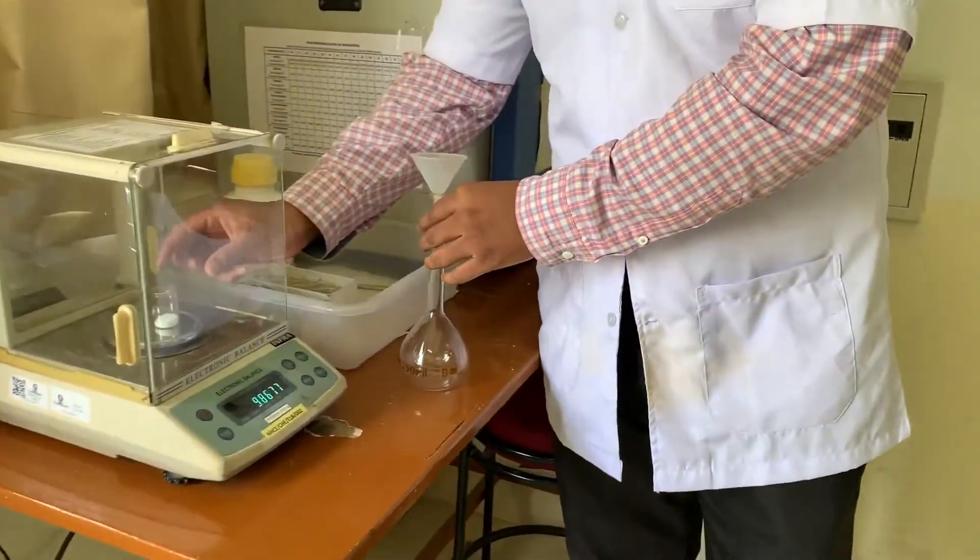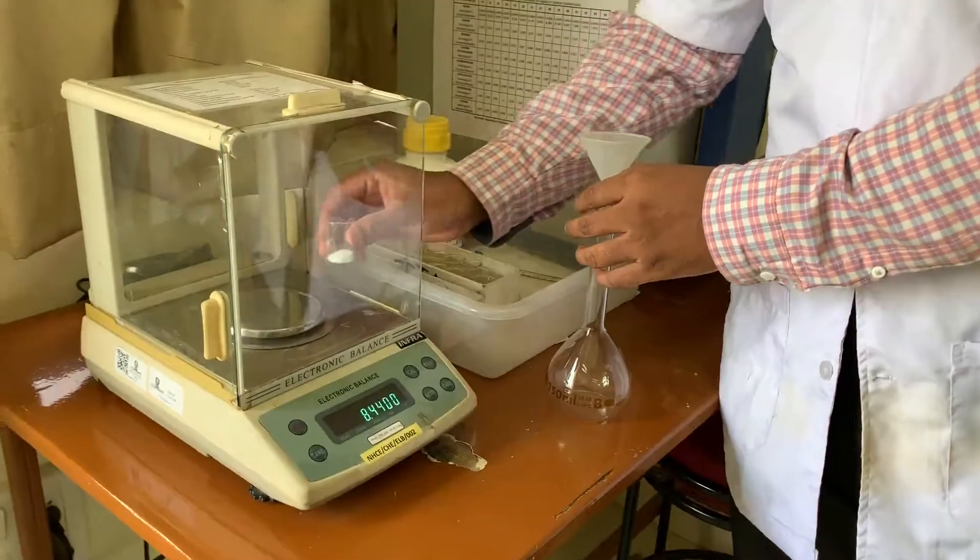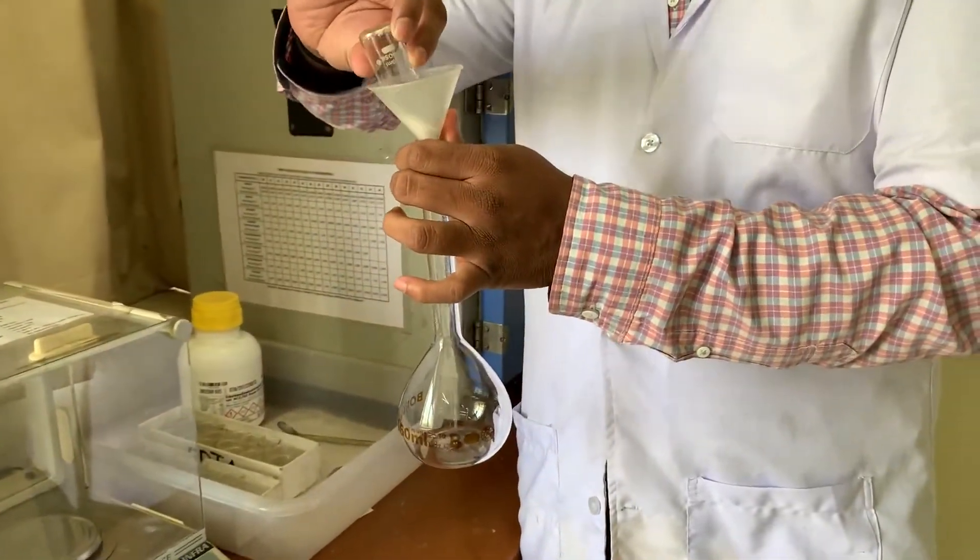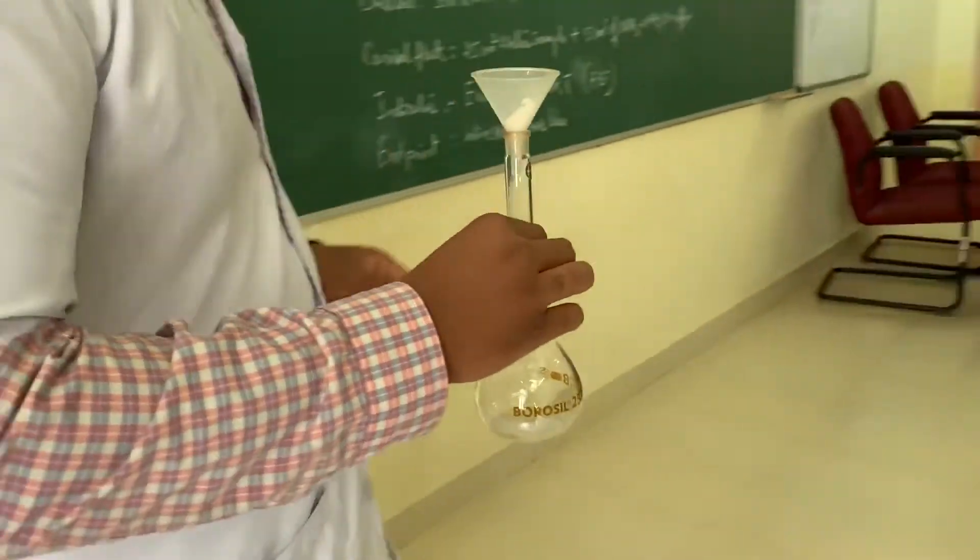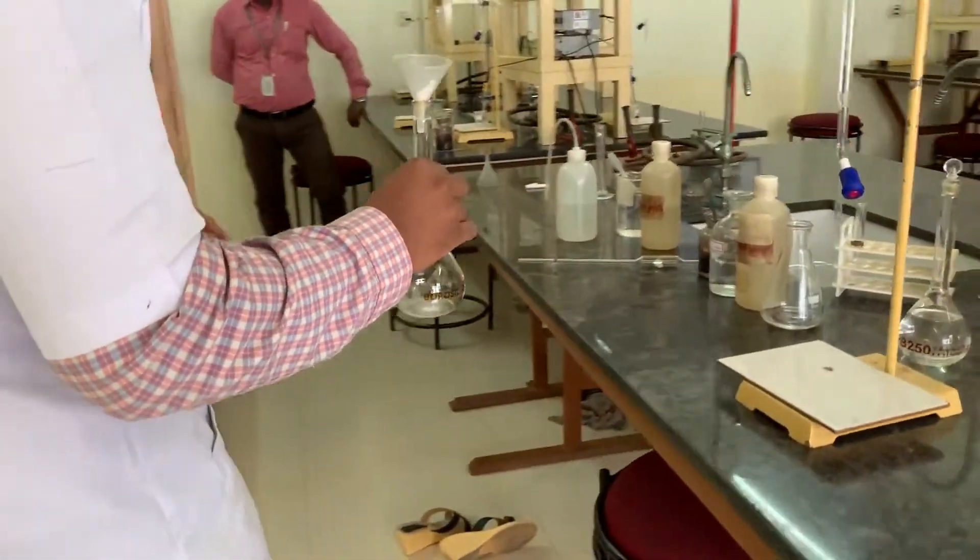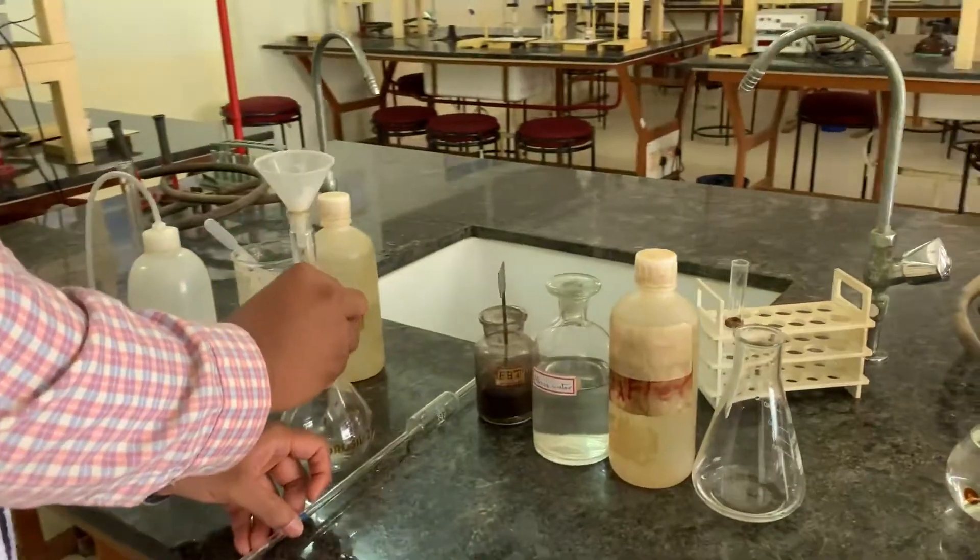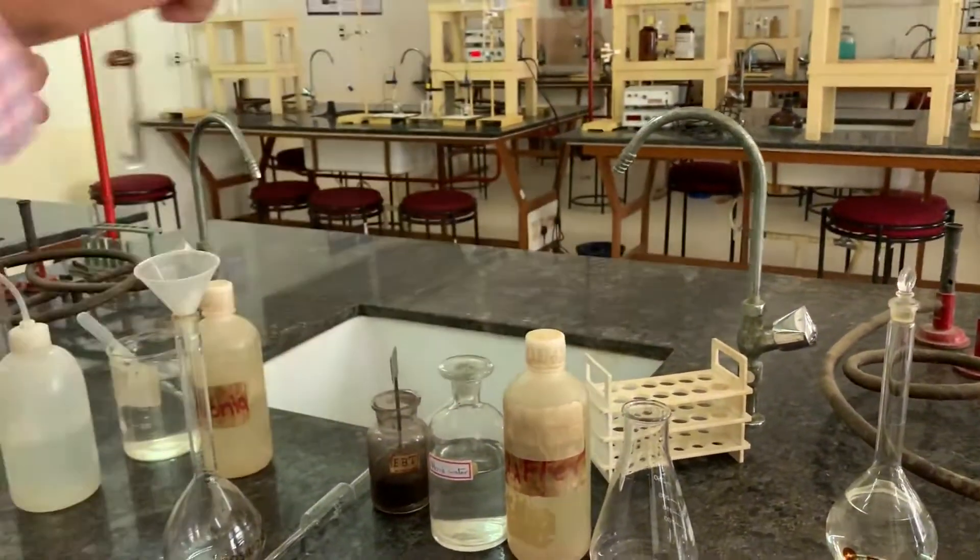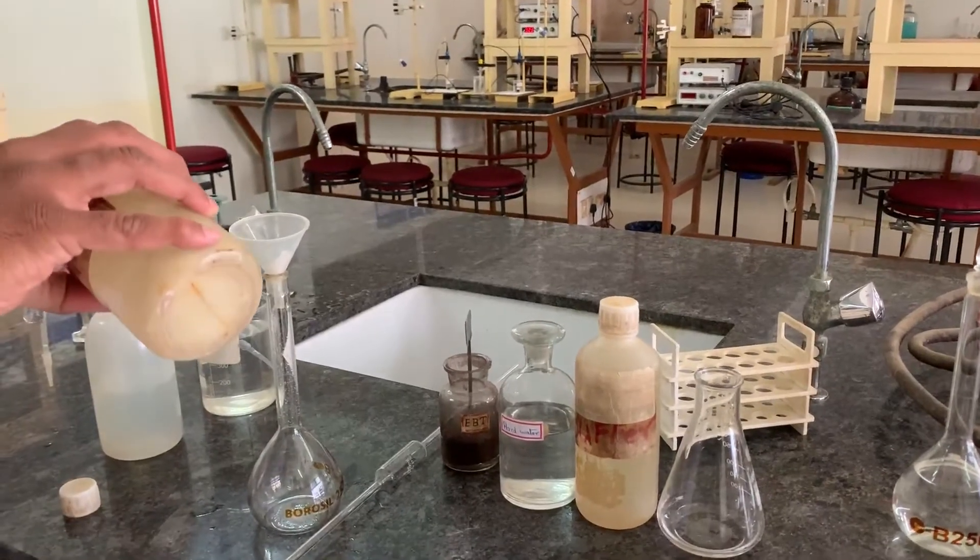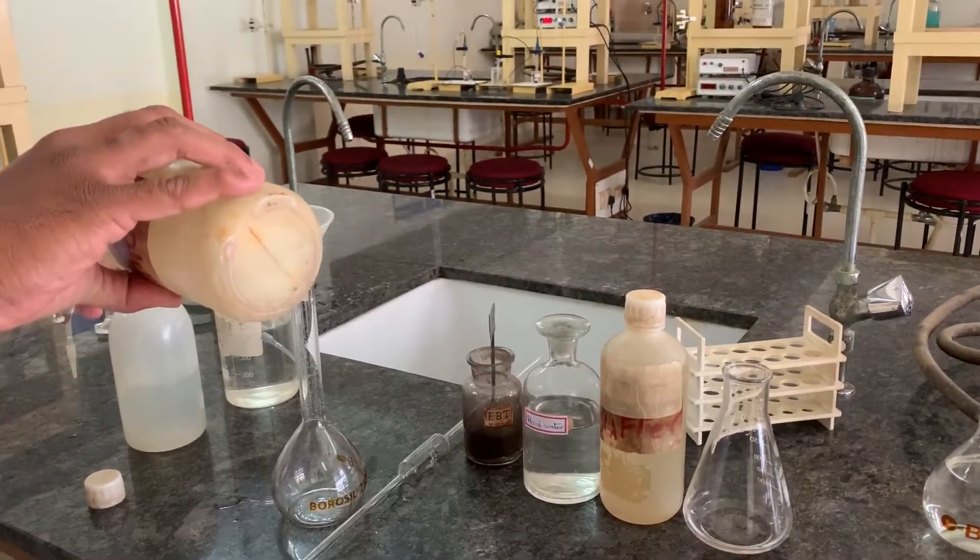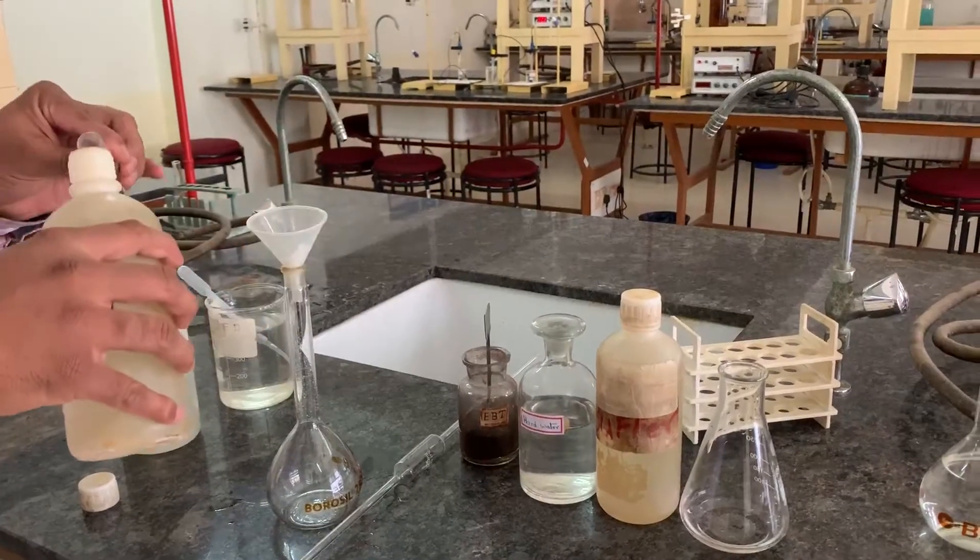Standard EDTA salt will be accurately weighed and transferred into the funnel placed over the standard flask. Then half a test tube of ammonia is added to enhance the dissolution of EDTA salt.